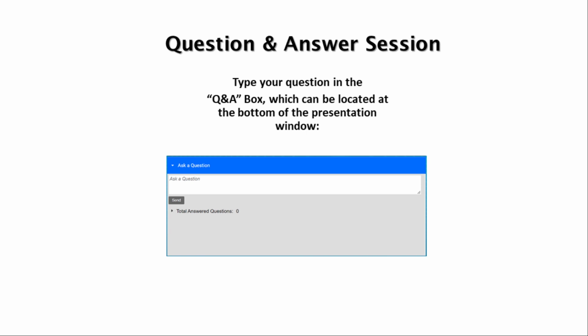Well, that perfectly leads into my next question here, just circling back on revalidation and verification. So what constitutes a revalidation versus a verification? Sure. So in terms of a revalidation, that would be where you actually changed your stationary phase, say from C18 to C8.